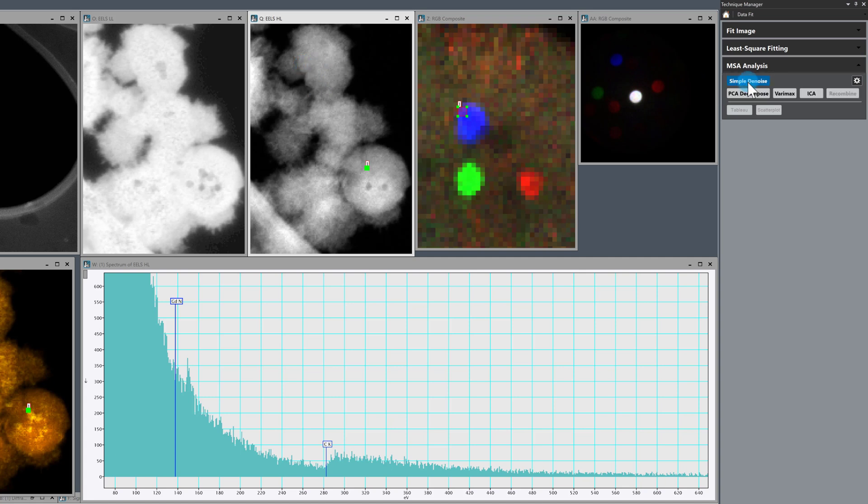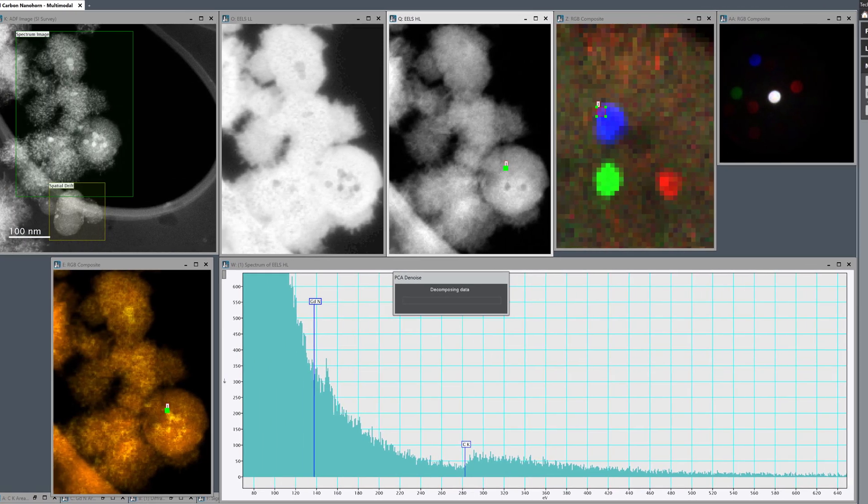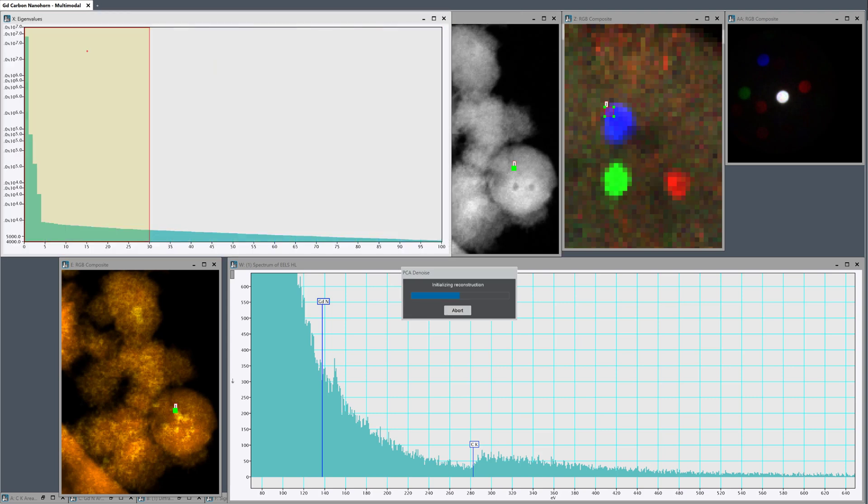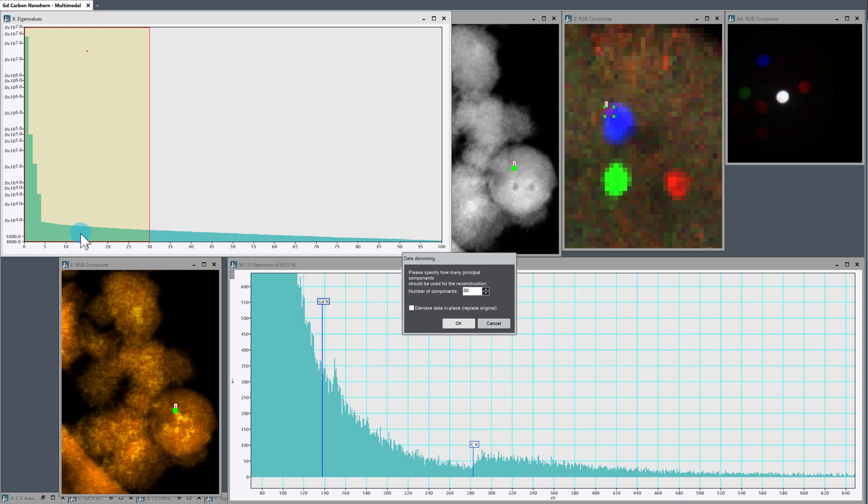And run that decomposition. It will throw up a scree plot. So the scree plots for the counting detectors are generally very well behaved. So we could, if we wanted to be very aggressive with our denoise, we could maybe go up to like four components here, the point at which it becomes linear. But I'm going to be fairly conservative. I'm just going to go for something like 50 principal components. So I'm not going to be too aggressive with my denoise. I'm going to press okay.